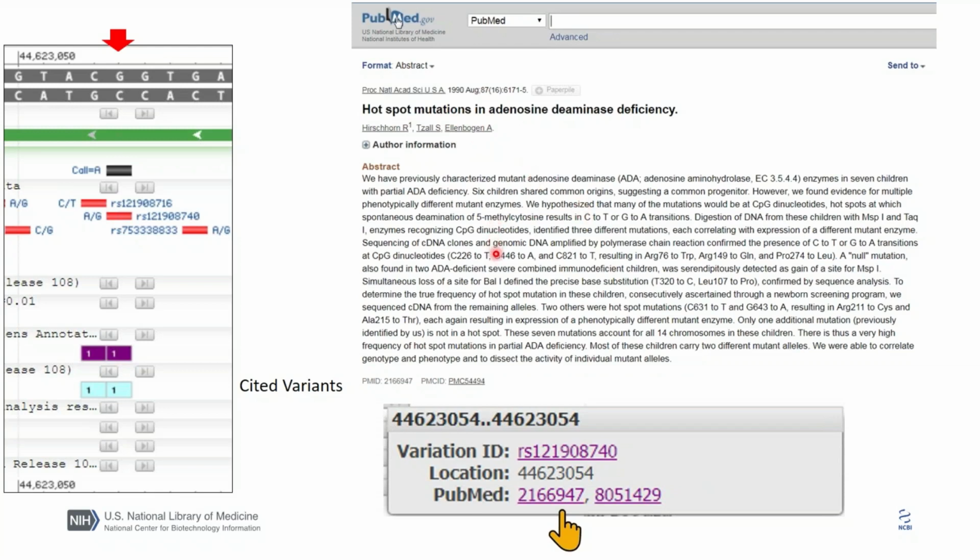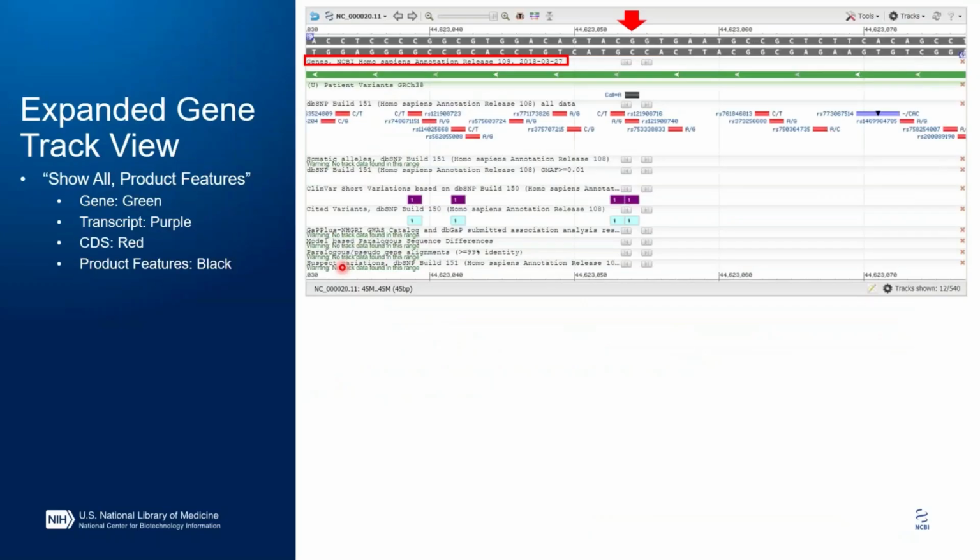So these data, combined with the data from the ClinVar track and the data that we saw in the table, suggest that this particular call from our collaborator is a promising candidate that we might actually want to pursue further. Now, in order to understand why this location might be a hotspot for ADA mutations, we can investigate the gene annotation at this region in greater detail.